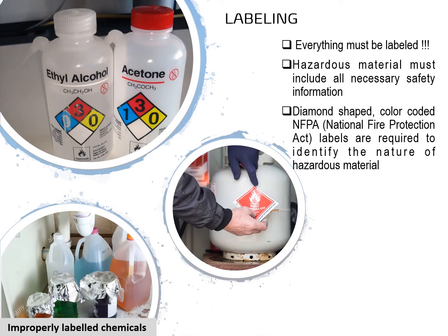For labeling, of course, everything must be labeled. Hazardous material must include all necessary safety information, and we have the appearance of our diamond-shaped color-coded NFPA symbol. It indicates the nature of the chemical inside the container. By looking at your NFPA symbol, it will give you an idea of the information on the flammability, the stability. We also have the specific and health hazard related to the chemical inside the container.